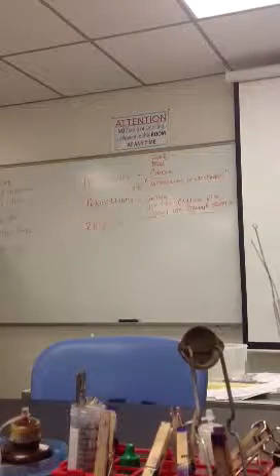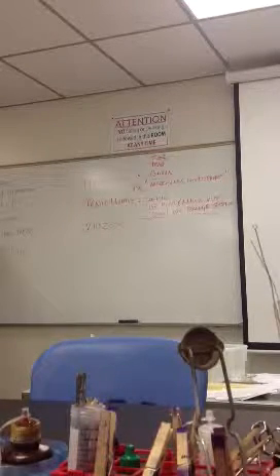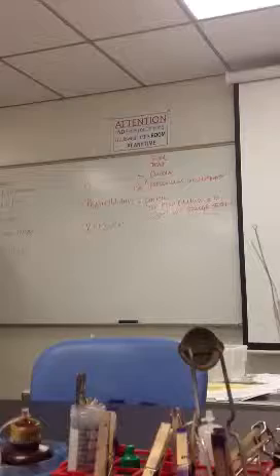Okay? Rhizopus. Rhizopus, I think, is the one where you can use any of the slides. It should be fine. This one, however, is two different structures. Okay, so there are slides that have, like, let's say, one of them. There are some slides that have both of them. So you can use whatever slides you want, just as long as you can see both structures.